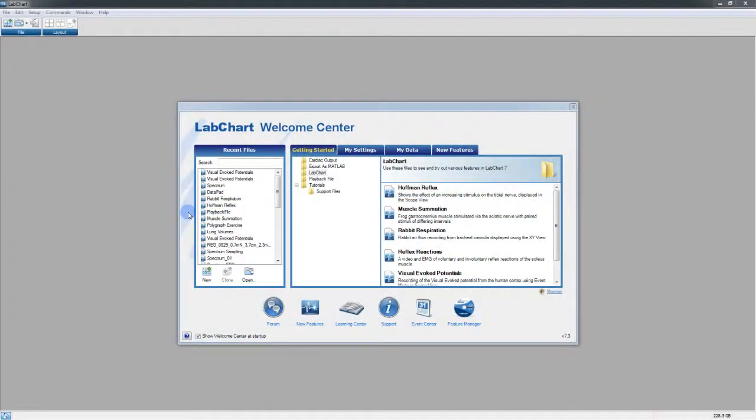The Playback File extension allows data from pre-recorded files to be streamed into LabChart in real time, just as if the data were coming in from an attached device. This can be useful for testing recording protocols before carrying out a real experiment, or for analyzing live signals that are expensive to generate, such as invasive procedures or pressure volume loop experiments. It can also be useful for demonstrating an experiment in real time where a PowerLab is not available.